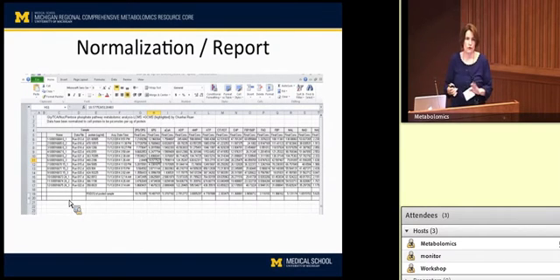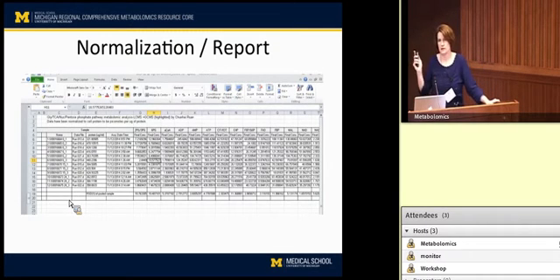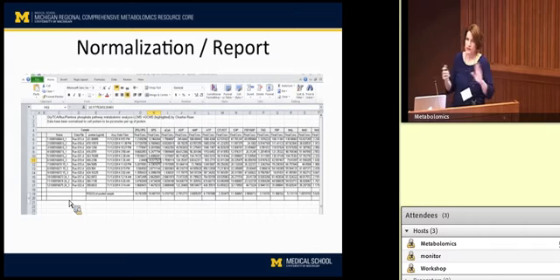So there isn't a lot of drying down steps or any other steps that are going to cause us to be concerned about the recovery. In our untargeted platform, which I'll talk about a little bit later, we actually have standards that go in right at the time of crashing, and then another one that comes in later to make sure that our recovery of anything that we've dried down comes back into solution properly. So that's a little bit different analysis that will come in during the untargeted talk. But like I said, in most of our targeted assays, the internal standards are right in the liquid that we're taking your metabolites out with, and there are no intervening steps. They go straight onto the mass spectrometer from there.